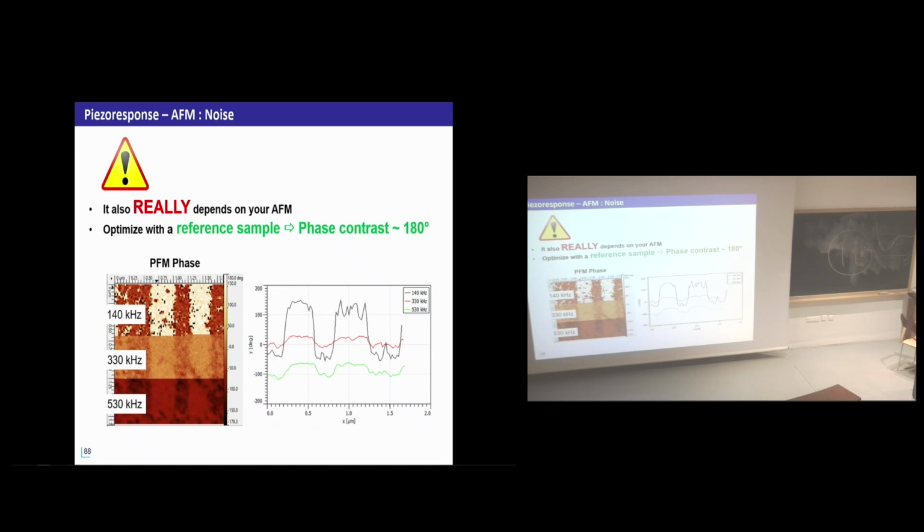And you cannot control this effect. You don't know exactly what the actual amplitude of oscillation of your material is. And if you want to measure, for example, the D33 parameters, it's impossible. Furthermore, we have such a system in the lab, and we use it twice a year. Most of the time, we don't need that. What you need is a very good AFM.